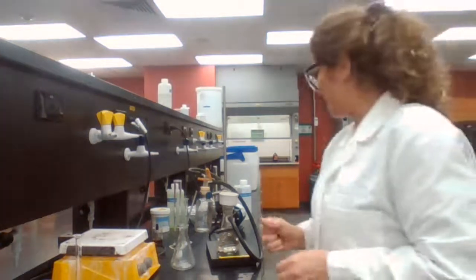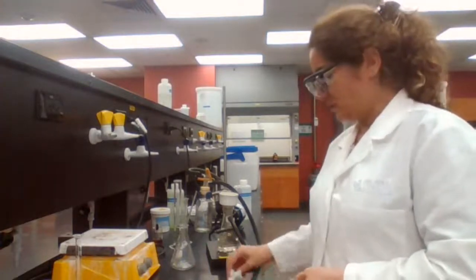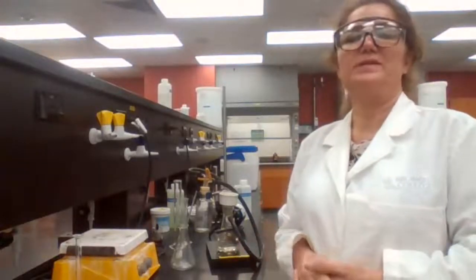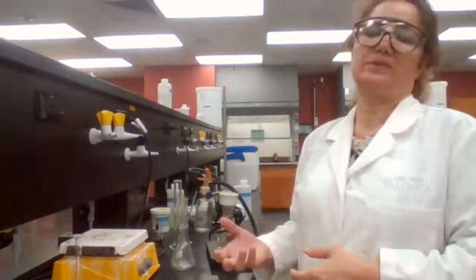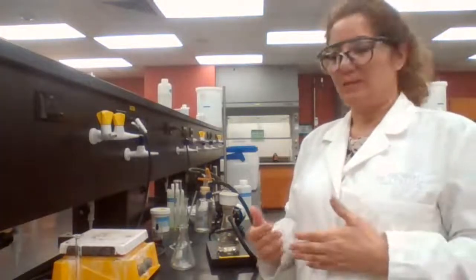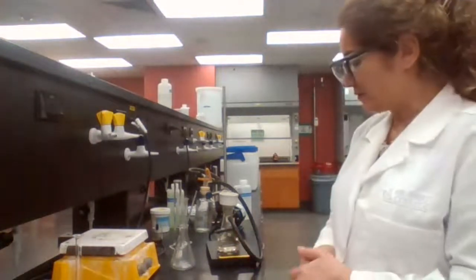And you can time it now. As soon as it's 5 minutes, we take it out of the oven and we check the melting point. If it starts melting below 100, that means your sample is not dry. Basically, it dissolved in the water that was in there. If it melts less than 100, then we have to put it back in the oven to dry. But if it melts higher than 100, then we are sure that it's dry enough.